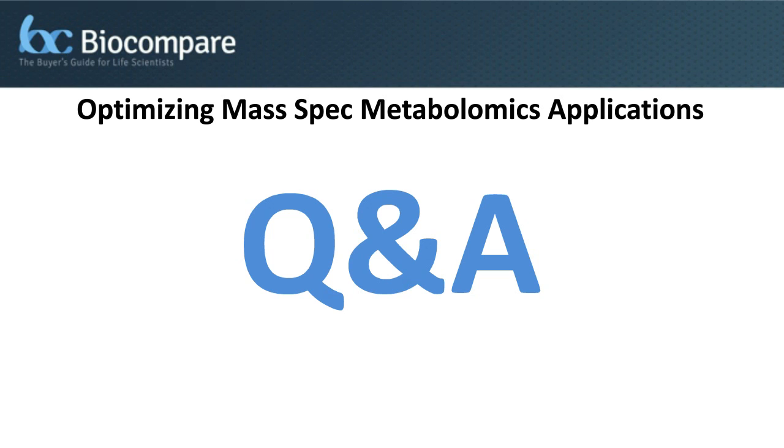The effective use of metabolomics in basic and translational research has game-changing potential. Unfortunately, the lack of standards often impedes the realization of this potential. This webinar will explain why standards are important, discuss best practices on how to create custom metabolomics libraries, and explain how to optimize mass spec analytical protocols.